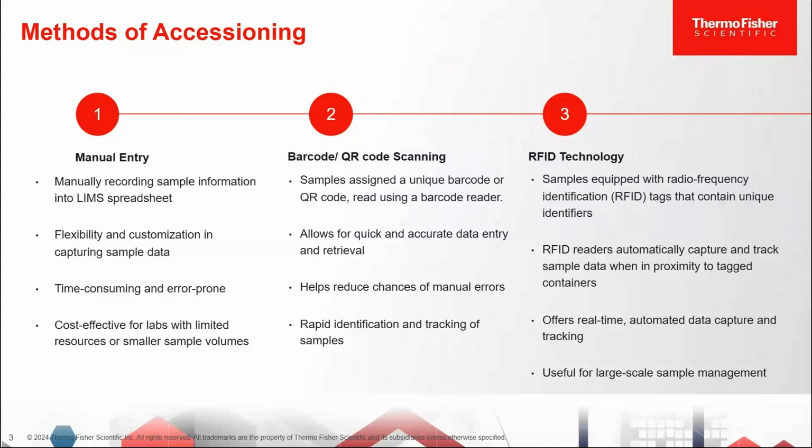This technology is also particularly useful for large-scale sample management, right? When you have a lot of samples to manage, this is actually a pretty nifty technology, where rapid and automated tracking is very essential when you go into those large volumes.